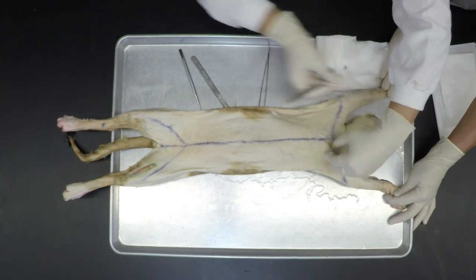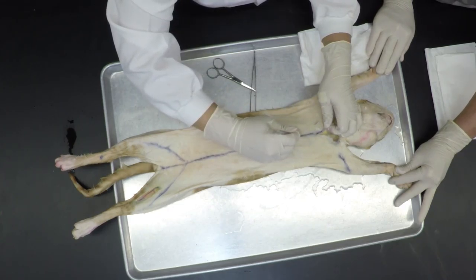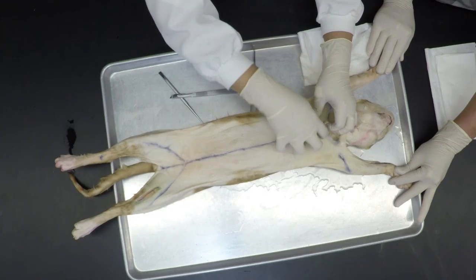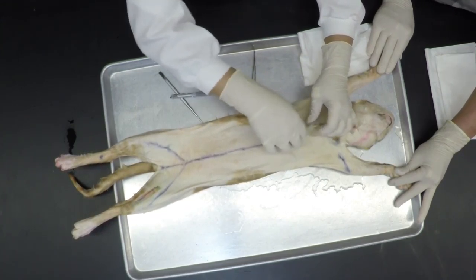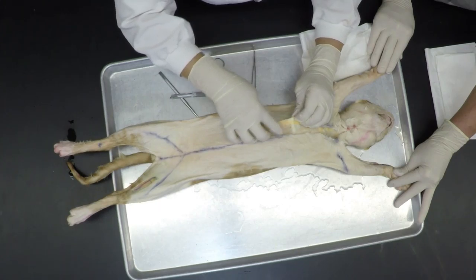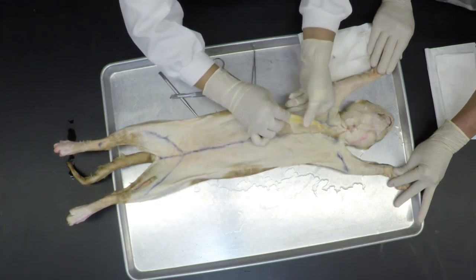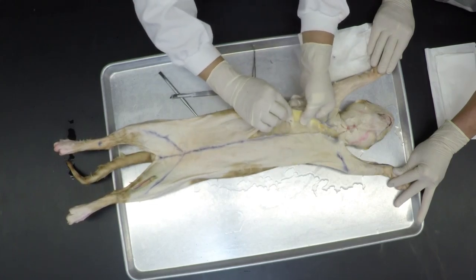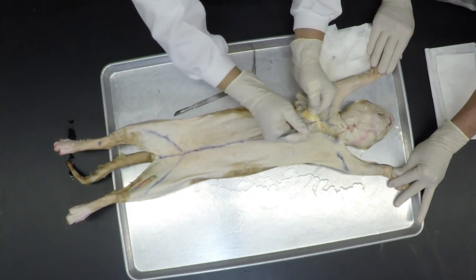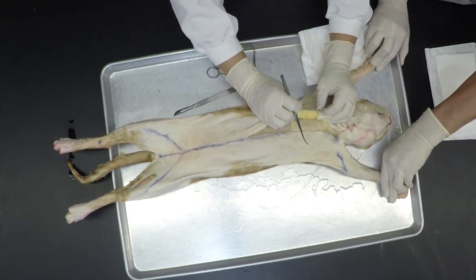Then give a very shallow cut straight down. You see, you can just separate the skin from the underlying muscle. This white part is the connective tissue, and you can use your probe to separate the skin from the muscle. These yellow parts are adipose, or fat.